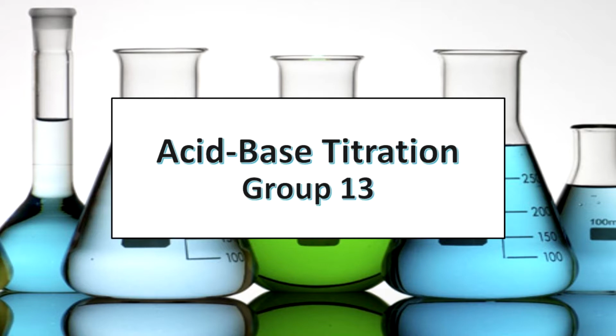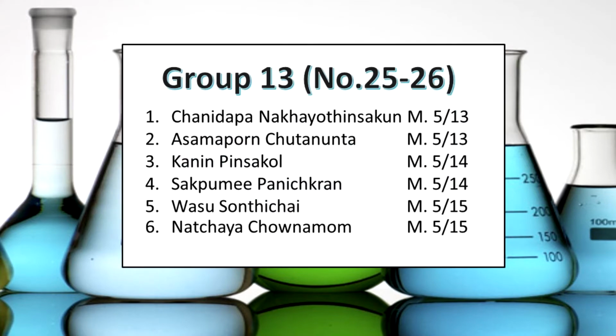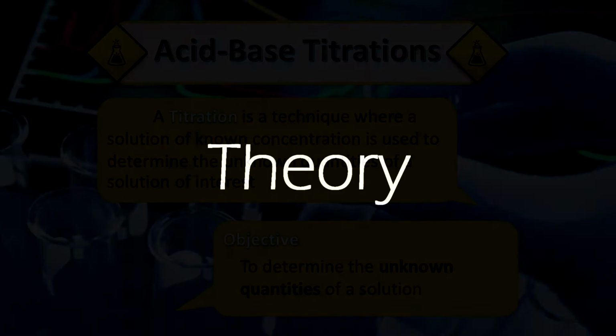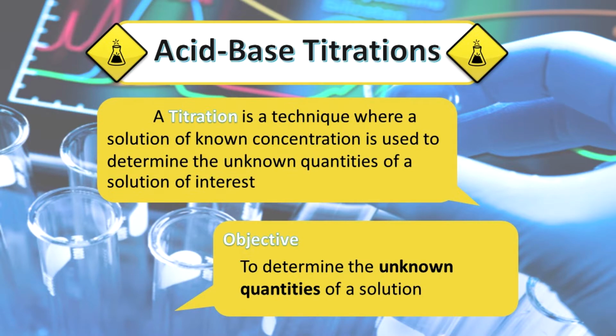Today, I'm going to explain acid-base titrations. A titration is a technique to find out more about a solution.